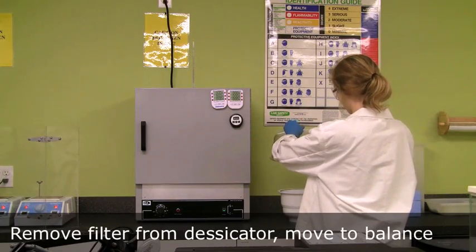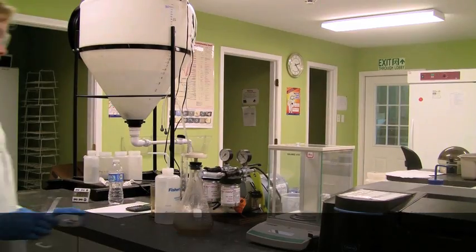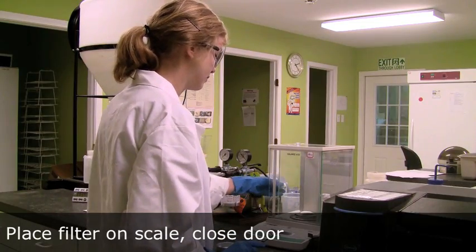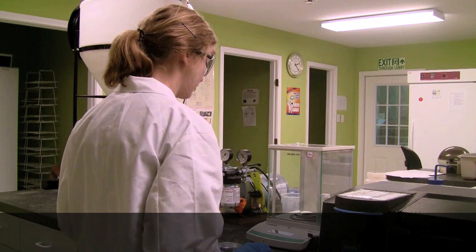After 30 minutes, the sample can be weighed. First, zero the balance with the door closed. Then open the door and place the filter on the scale. Remember to only use tweezers. Close the door and allow the scale to stabilize.